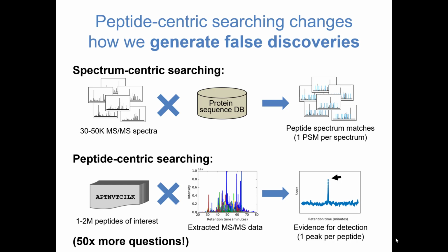I have a logistic equation, but how would retention time information from someone's spectral library be used for my system? I think Brian will get to that.